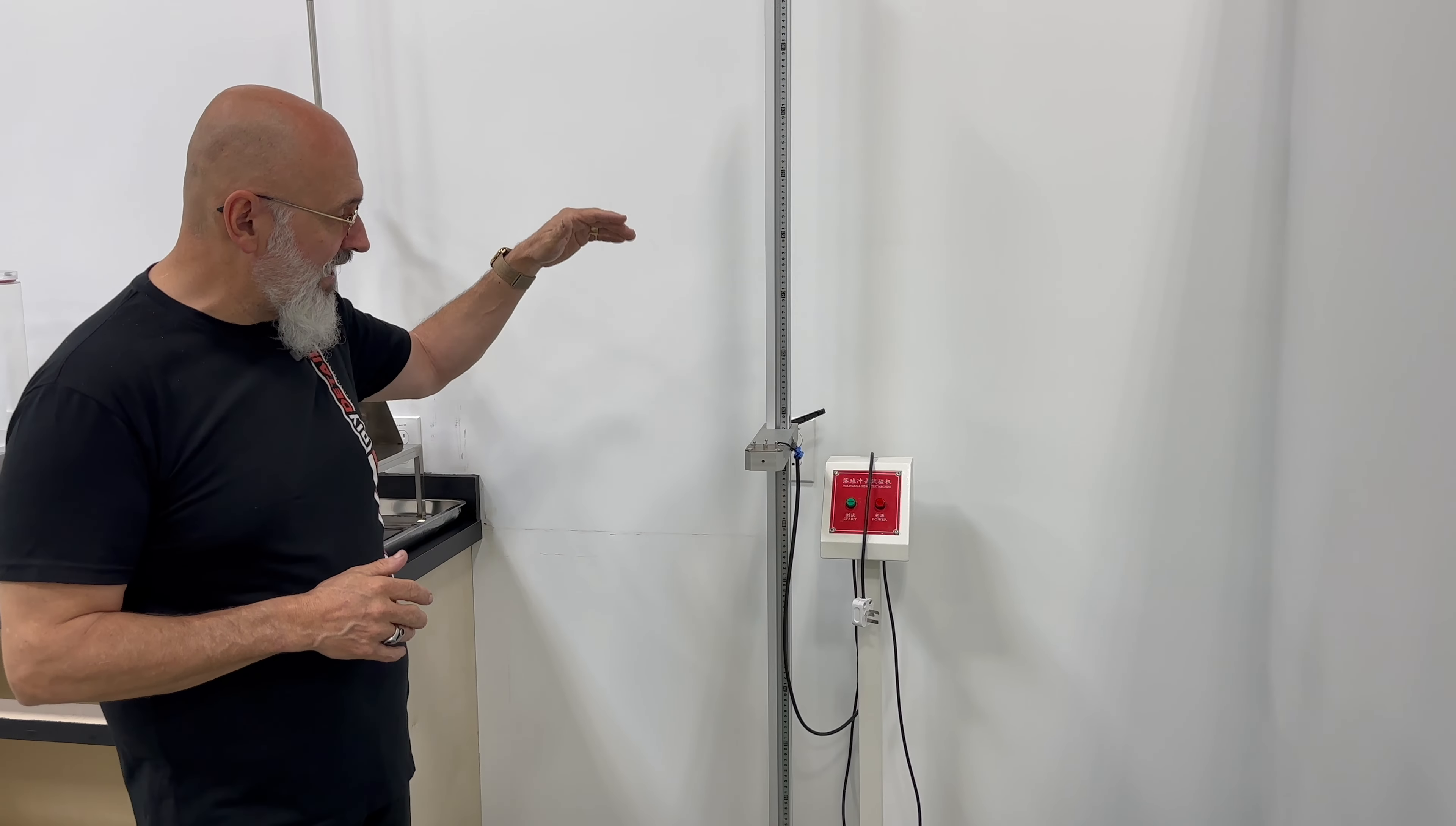The Tabor style abrasion tester is basically to give you the durability of a coating versus abrasion. And this machine does that more specifically for industrial coatings like the C6 industrial coating, but the DIY coatings have survived this as well.